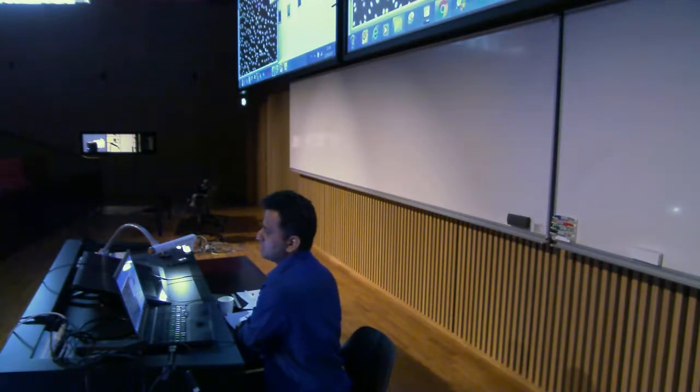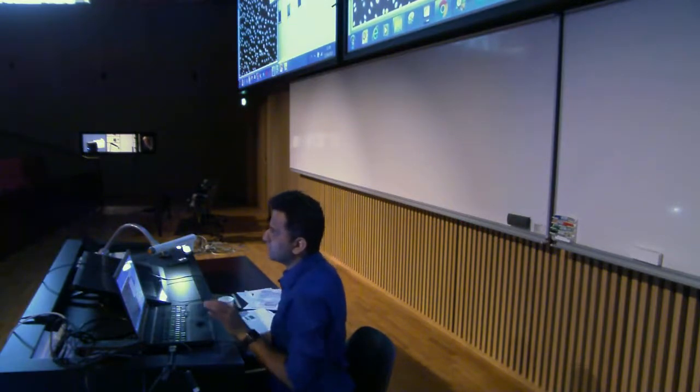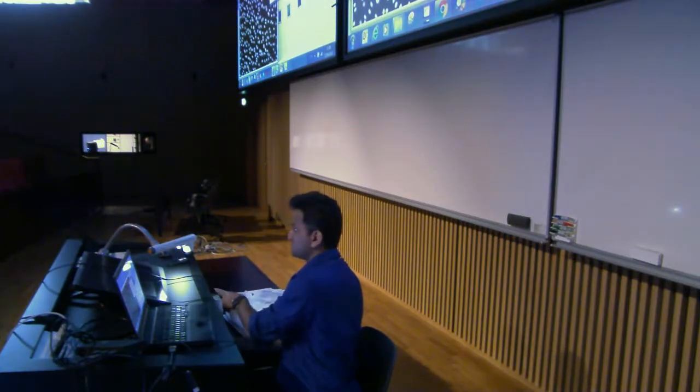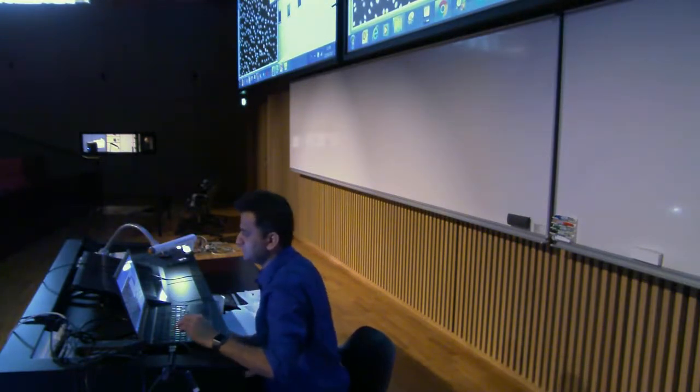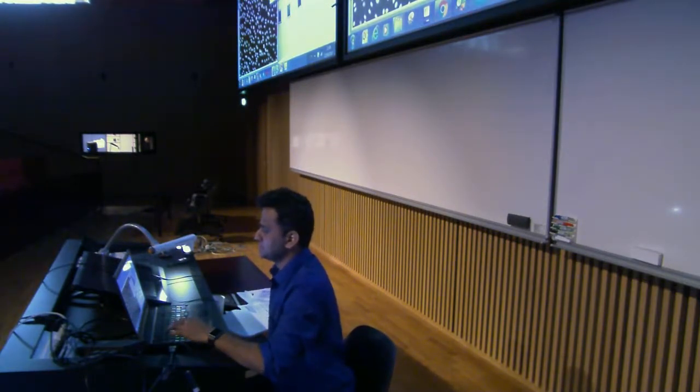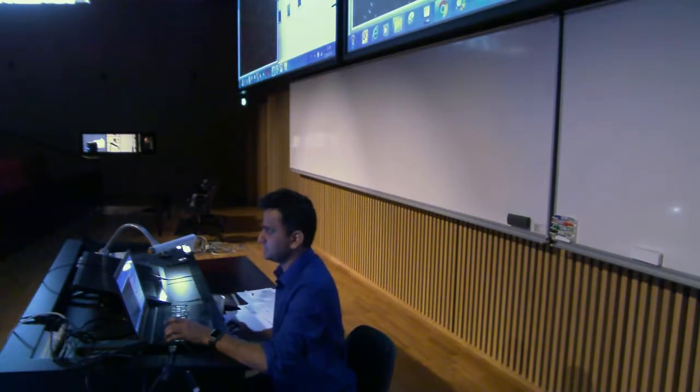Now, what is this rolling ball radius? I have explained extensively how this rolling ball algorithm works actually, and this is very useful, especially for Imaris and all kinds of segmentation. I mean, we use it a lot. There is a preview option here, and then you can see the effect of changing this rolling ball radius. Let's go to 100. If I make it very small too, you see the effect of changing this data.